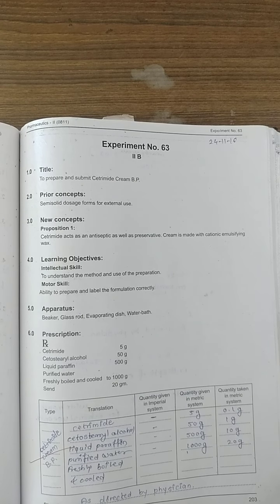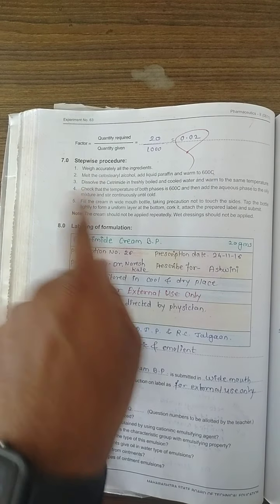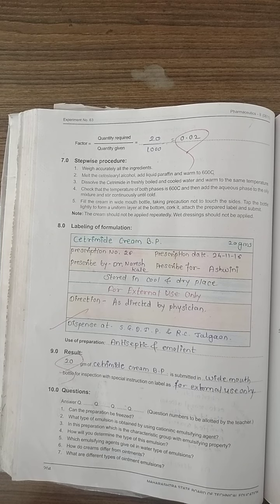We have to make only 20 grams, so we need to calculate the factor. We have to warm both phases to 60 degrees Celsius. The oily phase consists of cetostearyl alcohol and liquid paraffin. The aqueous phase contains cetrimide as the active ingredient.